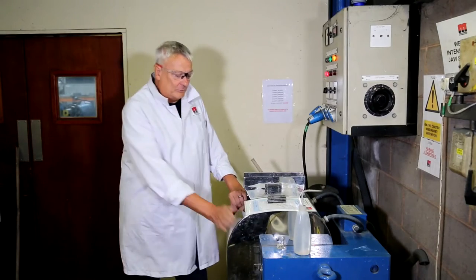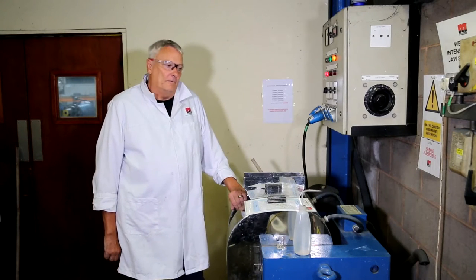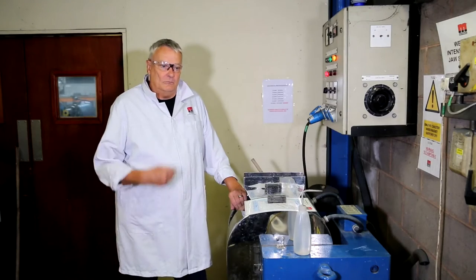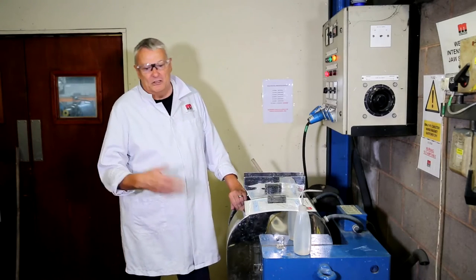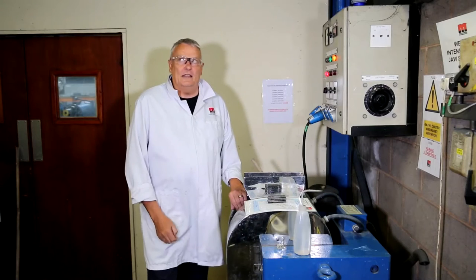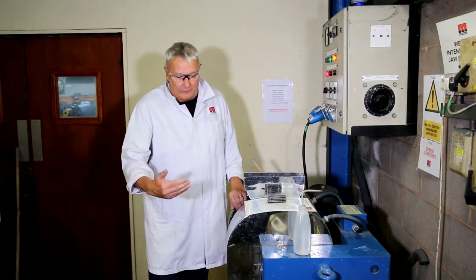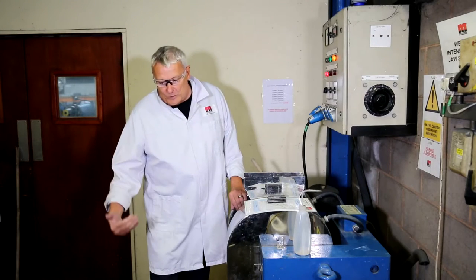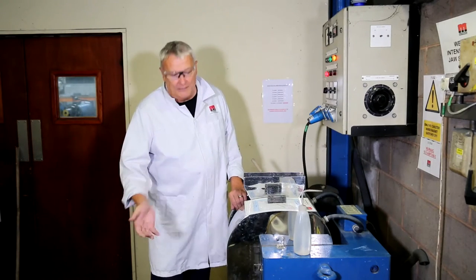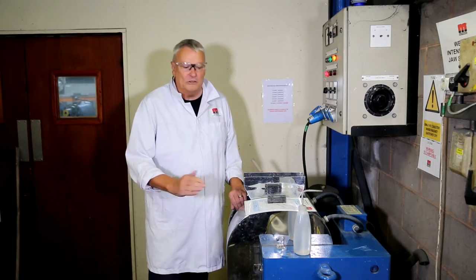Today we're going to talk about this machine here, which is our wet high intensity magnetic separator. People sometimes choose to process their material in a suspension, or wet, for a number of reasons. They might have a process plant that is wet already — it might have wet circuits, froth flotation — and then go to wet magnetic separation, so it suits their process flow sheet. They don't want to have an expensive process of wetting and drying material all the time.